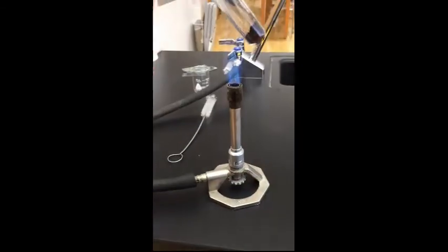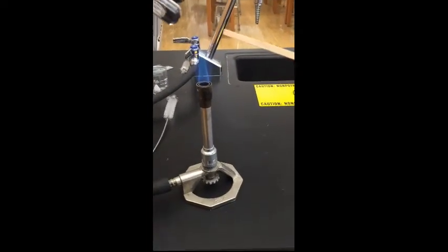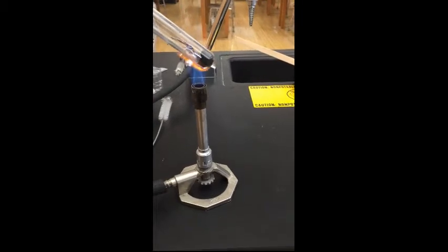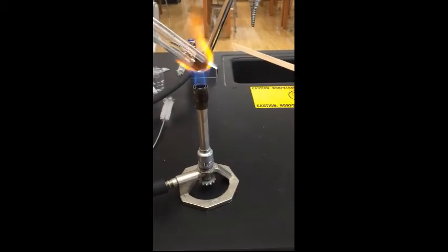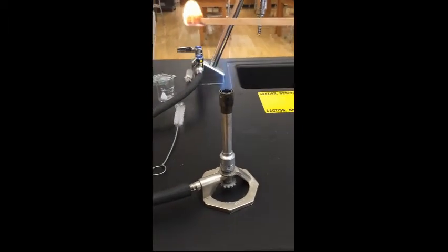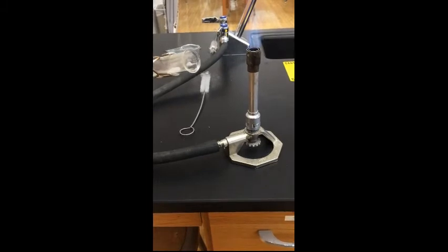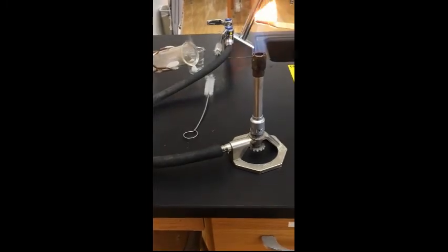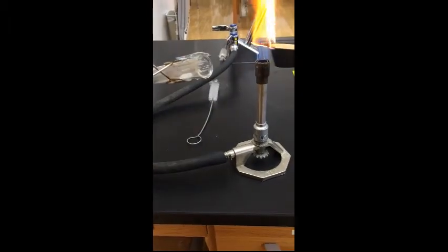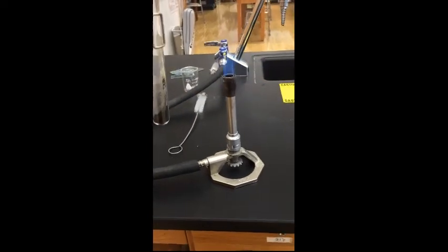So the second part of this asks me to get a wood splint, which I've got right here in my hand, and light it, and then put it in the mouth of the test tube that I just heated up. So let's do that. Got that going. I put it in the mouth. You saw what happened, yes? So there's your observation. As soon as I put it in the mouth of the test tube, it goes out. Okay? There's your observation.